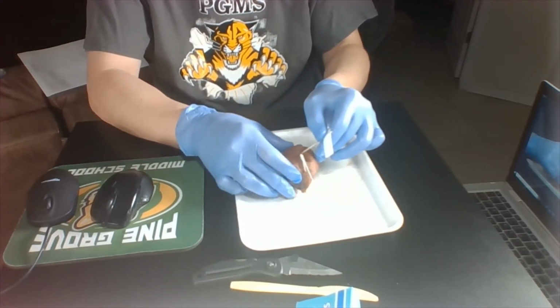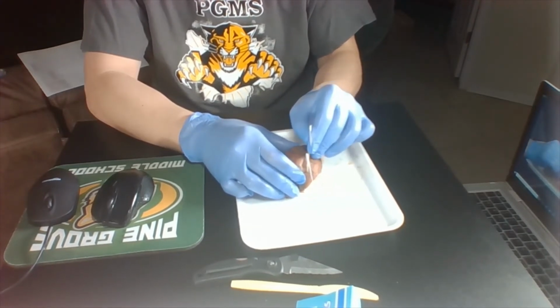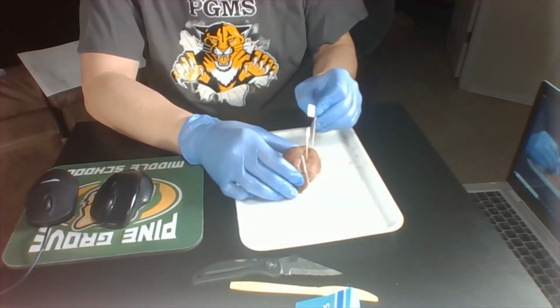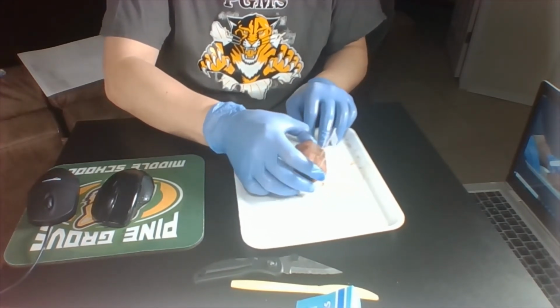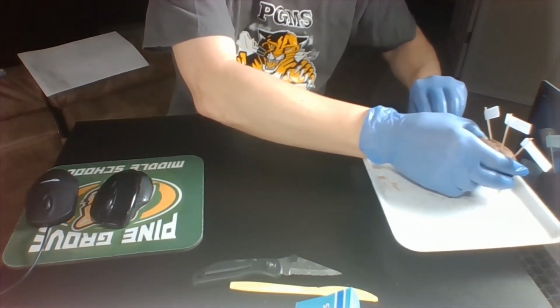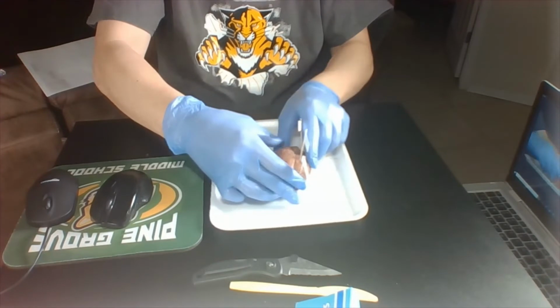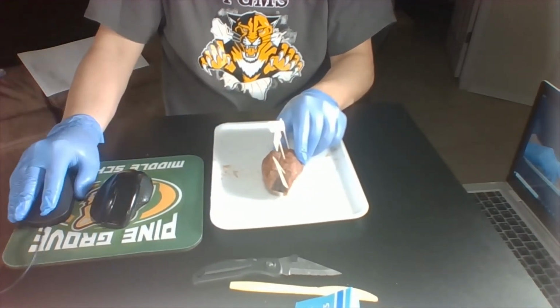and remember this is the cerebrum that we're marking in these lobes. And then the occipital lobe is in the back, and that's going to be your second identification. And we'll move that closer so you can see it. All right, and that's identification 2. Then don't forget to take a picture of it, and you're good to go.